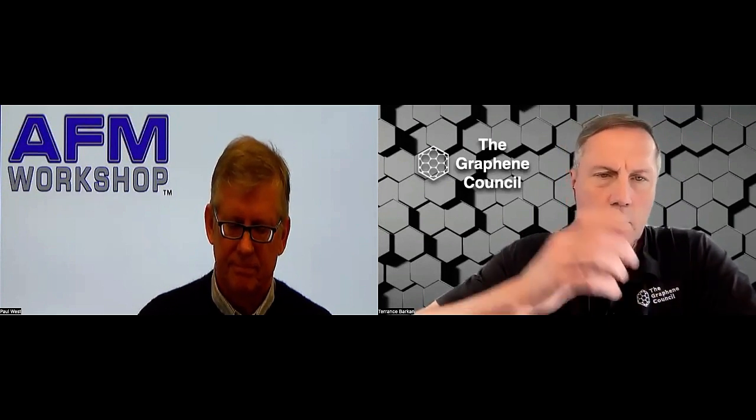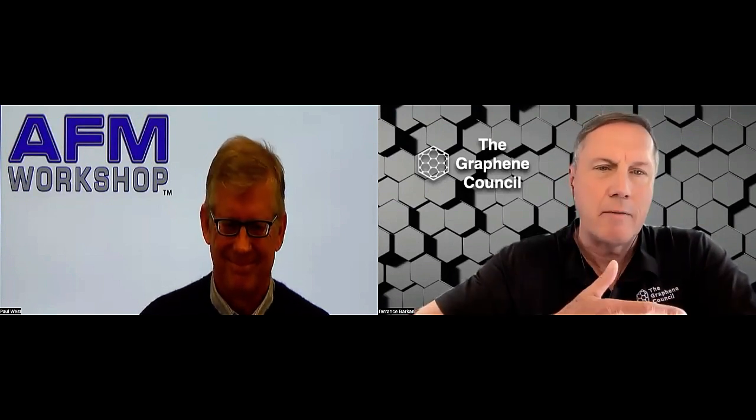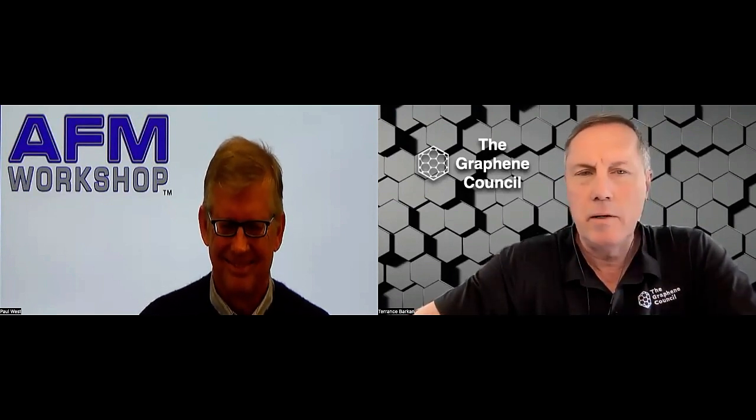And so what that means is to have a relevant number of samples, you can take this image and then you have to decide which of the flakes that you measure. Can you talk a little bit about maybe approaches or techniques to eliminate bias? Because the operator can look at that and say, okay, I'm going to measure this flake, but not that flake. Is that a relevant question? Well, I think it is.